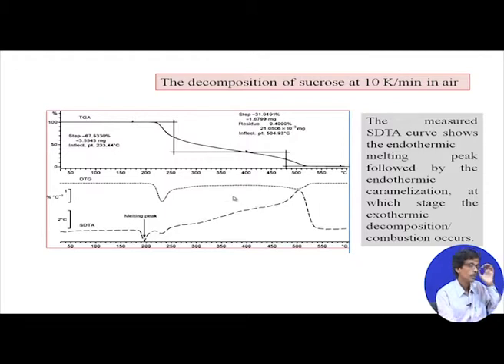But what sort of burning this is, whether it is exothermic or endothermic, just now we have seen in some other example that when we have the plot in the upward direction in the derivative plot, we call it exothermic, heat is being released, energy is being released. But if we consider the corresponding derivative plot of this, the change of this is typically the endothermic melting process, or food engineers basically say, in food chemistry, this is caramelization.